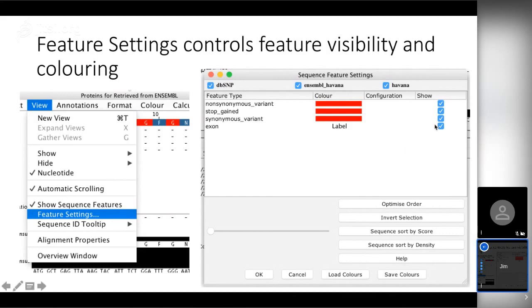You can hide and show these features and give them different colors. Jalview gives them all a red color, except for the exon which it colors according to the exon number.